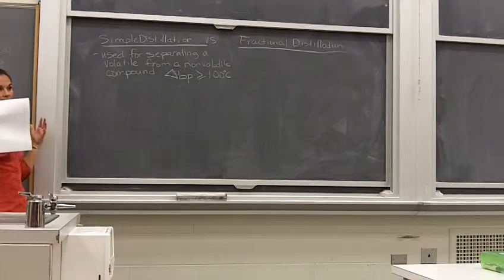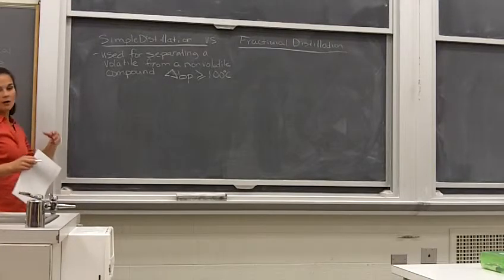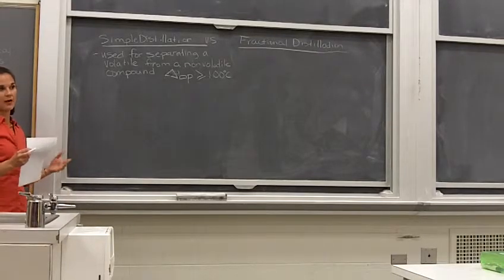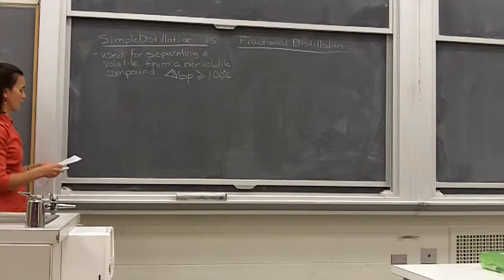So you need a very large difference in order to make that work. And so, like, with experiment 1, your neutral compound and the hexane, your neutral compound's boiling point, not melting point, but boiling point, was much, much greater than hexane. And so that's why it worked. Same with trimyristin. The boiling point of trimyristin was much, much greater than ether. So that's why it worked in experiment 3.